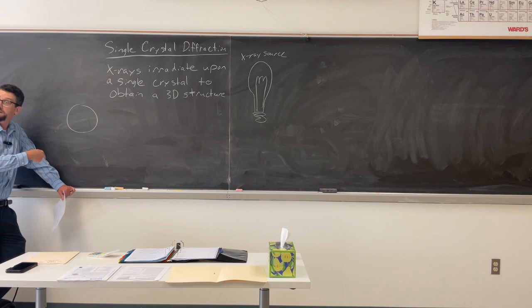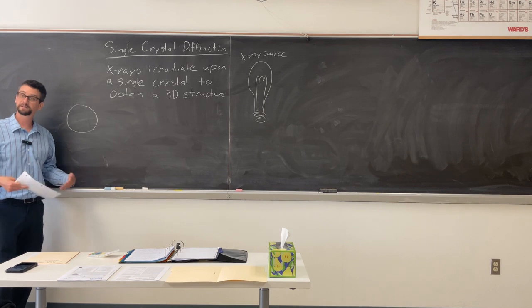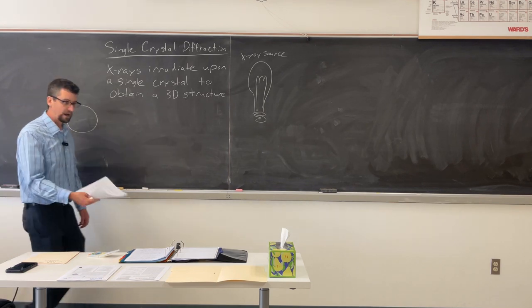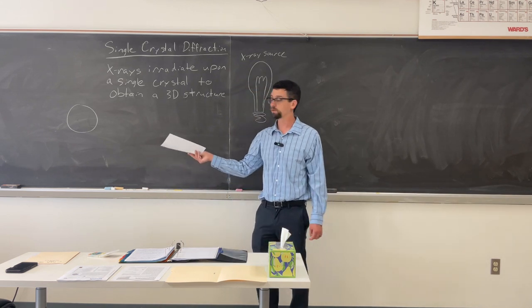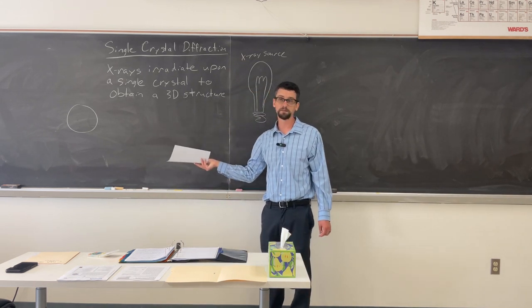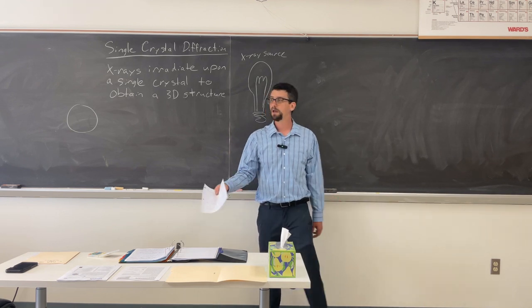You can buy or purchase beam time from these spots. So anybody can do it. You have to put in a request to do it, and they either say yes or no. A lot of my friends who make crystals will buy beam time, mainly at Brookhaven because it's the closest spot to here.